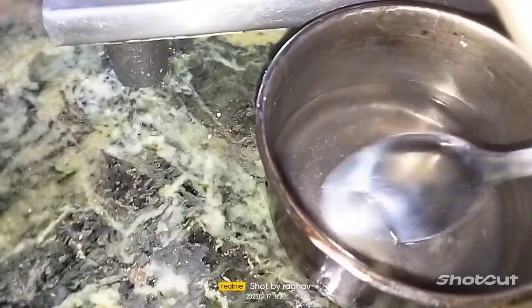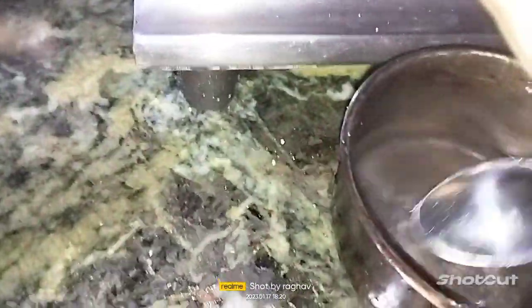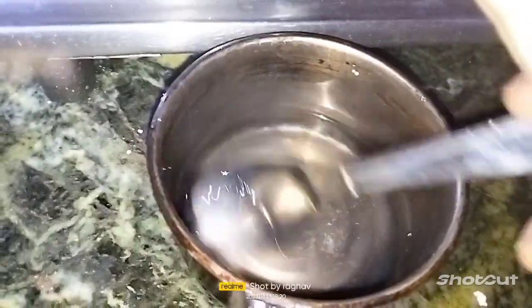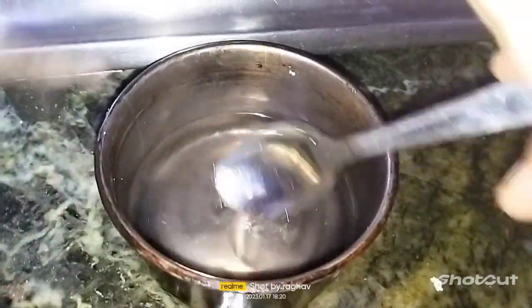You can see this. I am pouring the glucose on the acetic acid, CH3COOH, and the formula of glucose is C6H12O6. Glucose mainly provides the energy to the body. It is a source of energy. You know very well, when food is broken down, it converts into glucose by the amylase in the saliva.